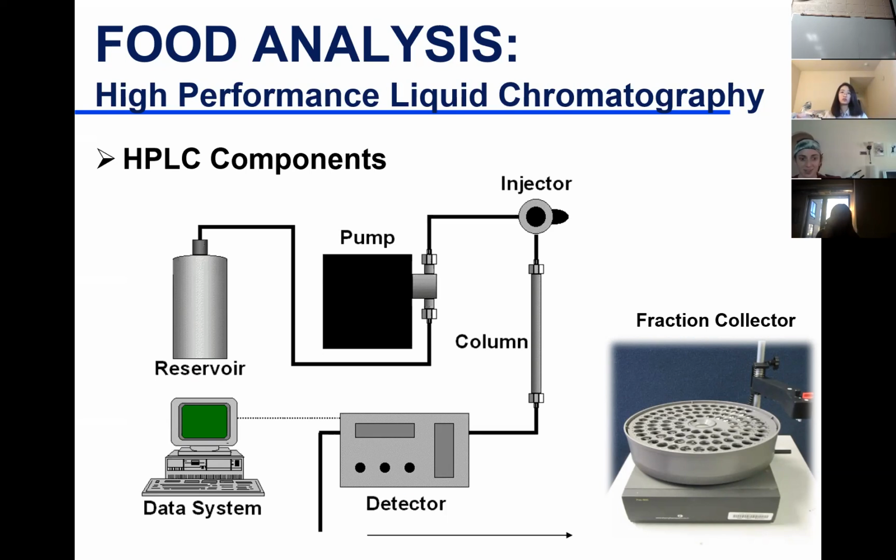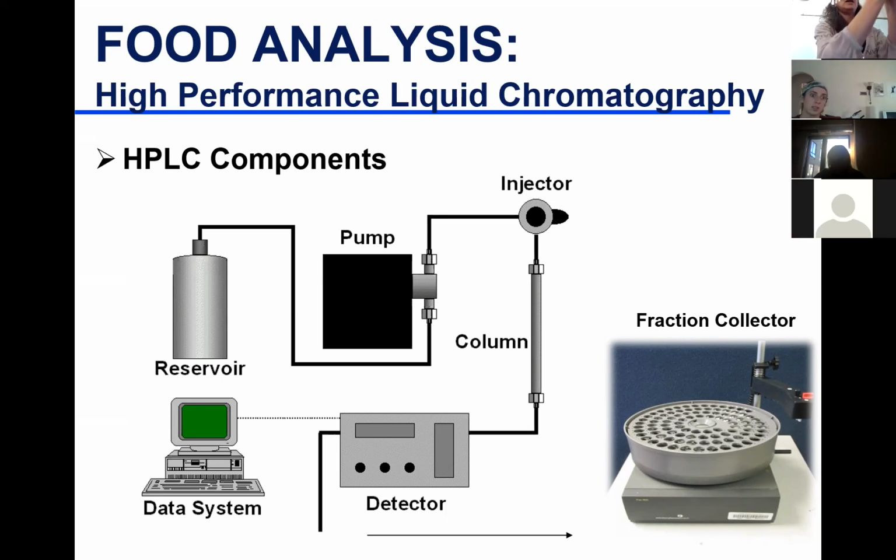So in order to collect the different components, we have fraction collection, a compartment where it would be timed, like after every 5 minutes, it collects a certain amount of sample and moves on to the next.